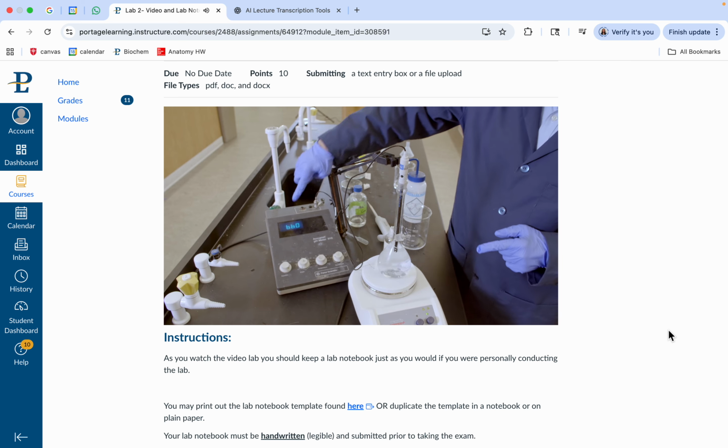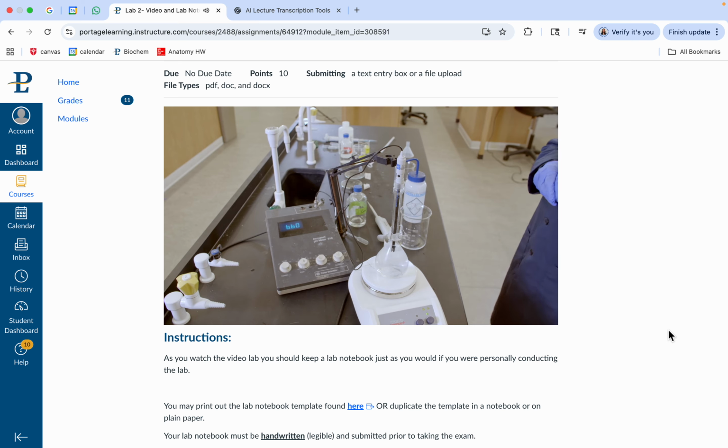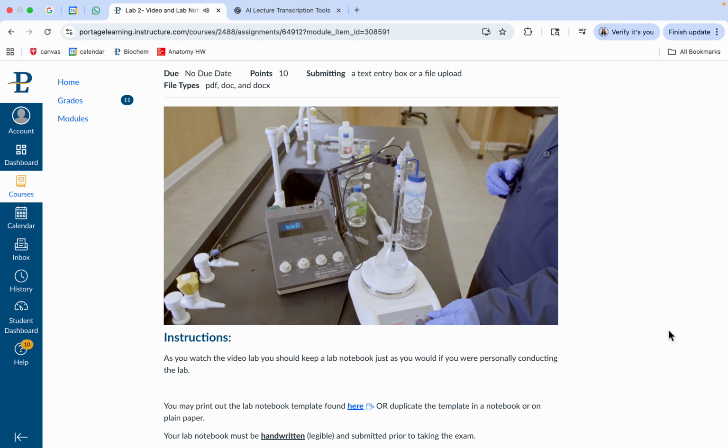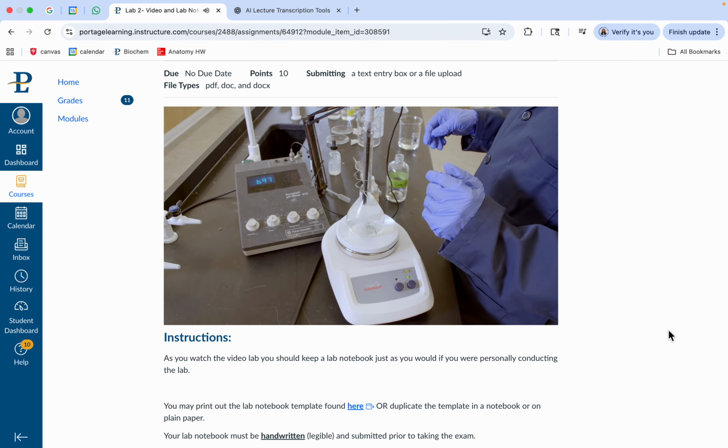One of the things is we get a sort of a sneak peek at the pH of this buffer. Again, as these continue to dissolve, it's about 6.6. So notice that's a little short of 7, where we want to be. However, we still have some solids that need to dissolve, and those could actually alter the pH a little bit. So we're going to let this rotate. Okay, so we're getting to the end. I think all the solids have dissolved, and as you can see, as those dissolve, we actually got the pH up close to 7, so 6.97.